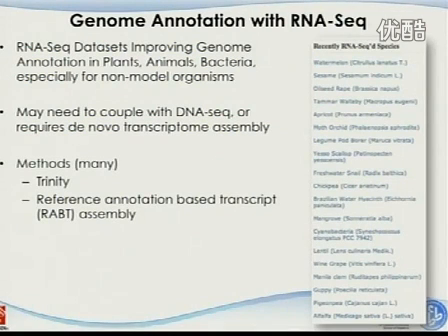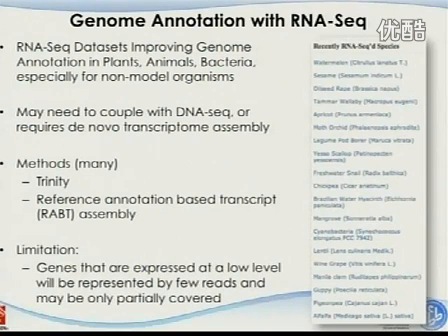And there are some tools that can do that, including Trinity, and I hope I will talk about that a little bit. I tried to read that paper and never understood it; assembly in general is beyond my head. But I will try my best to summarize it. And there's another published tool that you can take a look at.